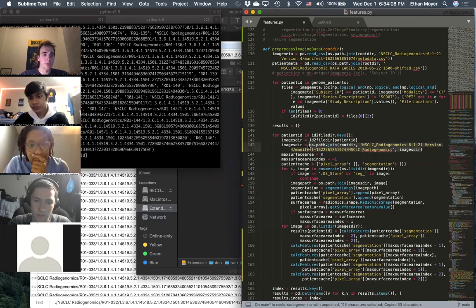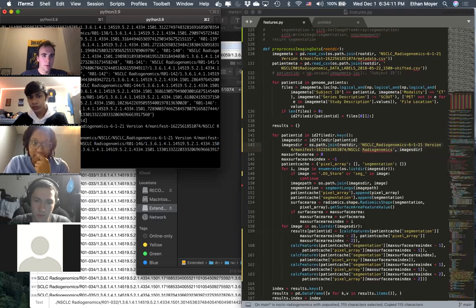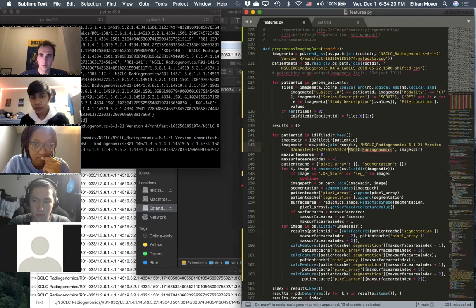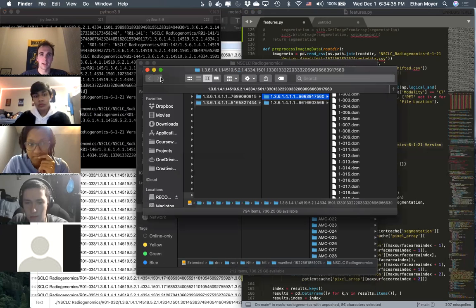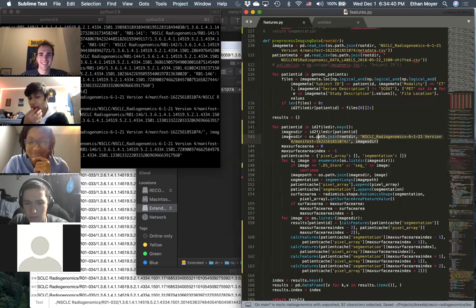And then you should probably join it like that. Is this the correct path? Manifest. I think we have too many genomics here. There we go, that's the path. I like how computers do that. They tell you, yes, you got it right. I think that's a brilliant feature.